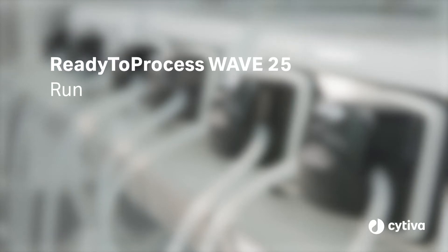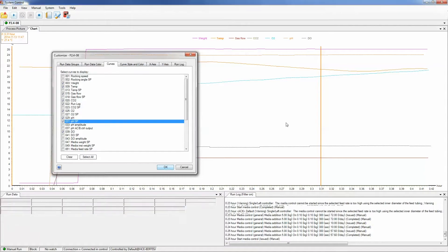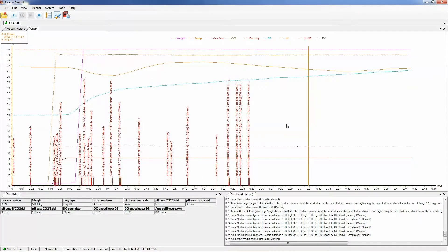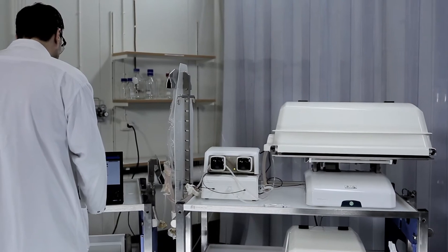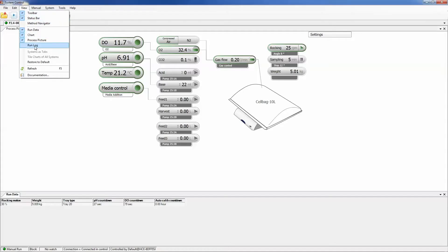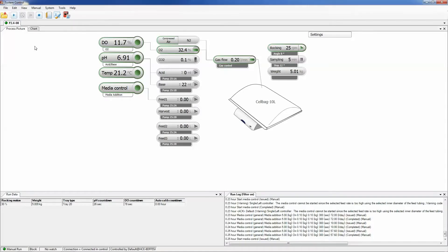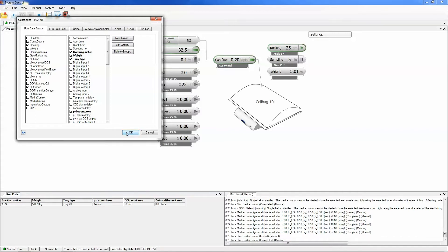In the ready-to-process Wave 25 bioreactor system, data acquisition and system control is enabled by the Unicorn System Control software. A dynamic graphical user interface shows real-time status of the run.